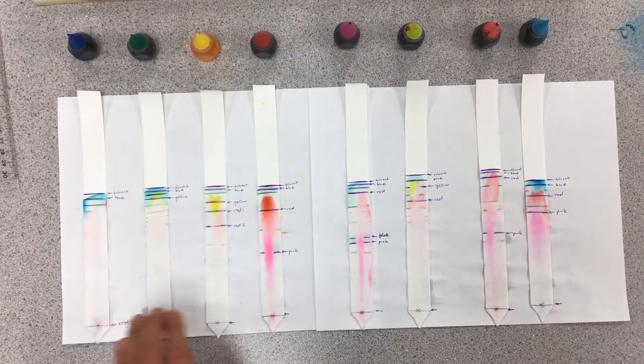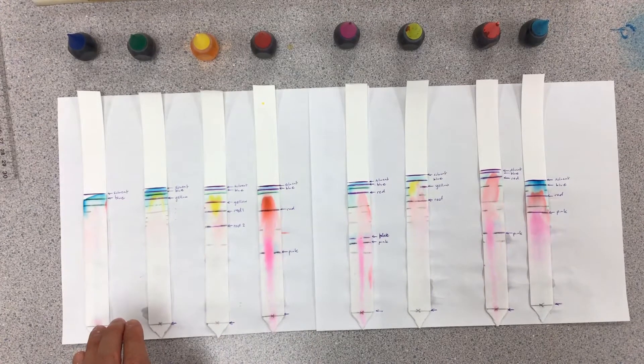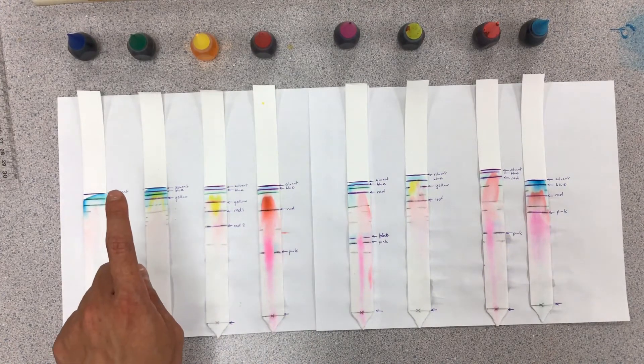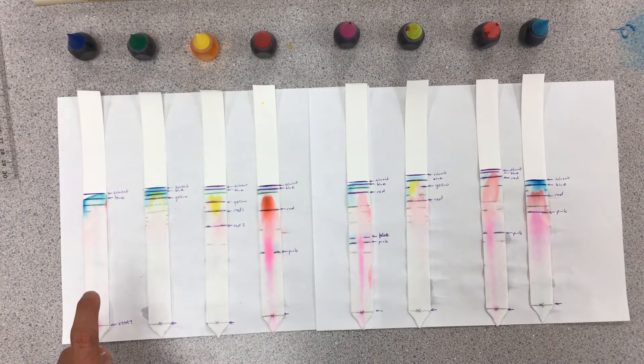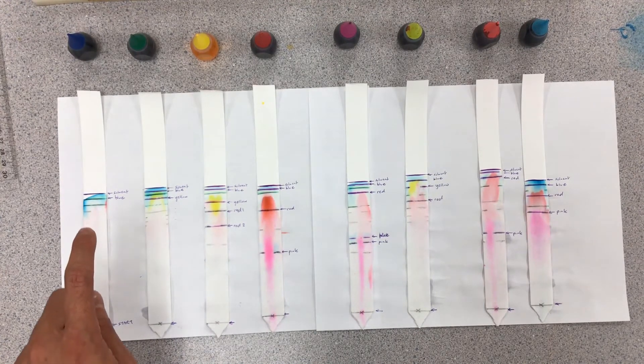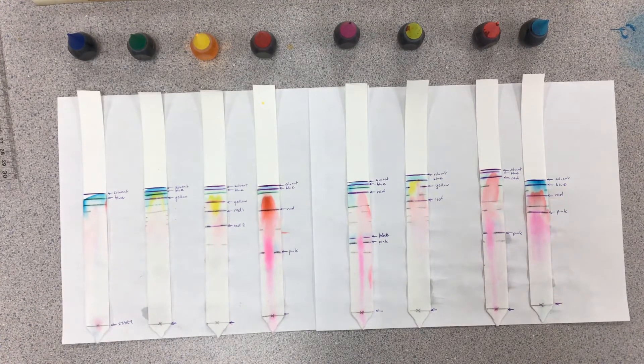All the runners at the starting line, but as they run, the faster runners will run really close with the solvent, while this other solute that isn't as soluble drags behind and is physically now separated from the rest.